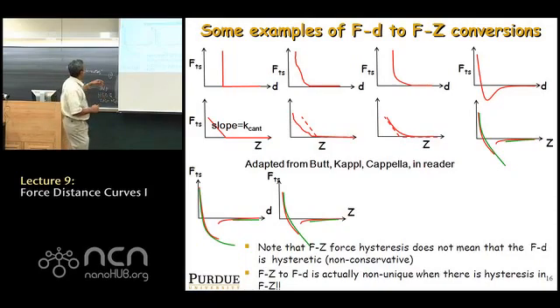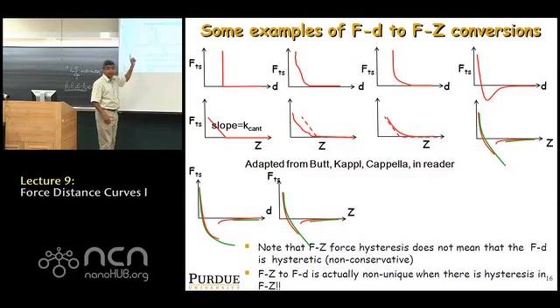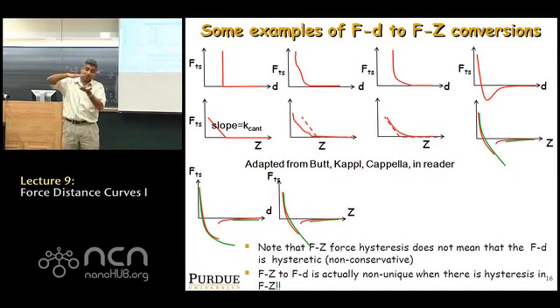What you would get is actually shown below, F versus Z. Think about it. Now you've got a cantilever coming close to the sample, it touches the sample, right? So before it touches the sample, the deflection is 0. But once it touches the sample and you keep pressing the base of the cantilever down, guess what's going to happen? The cantilever is going to bend as much as you move the Z down, because the sample isn't moving, it's infinitely rigid, right?